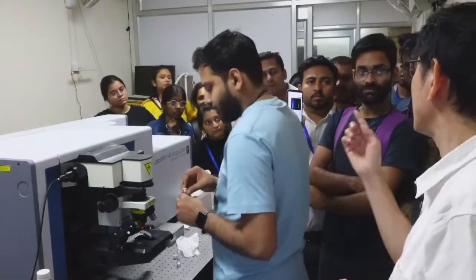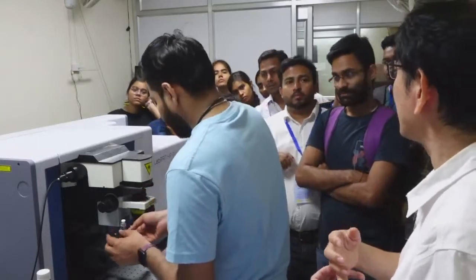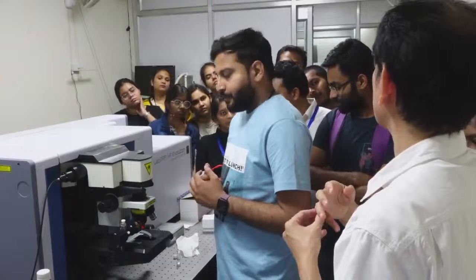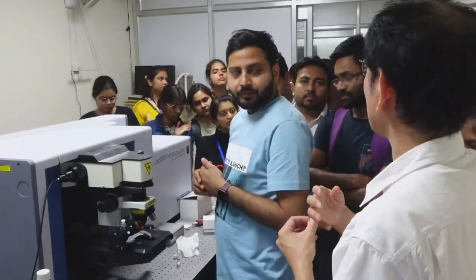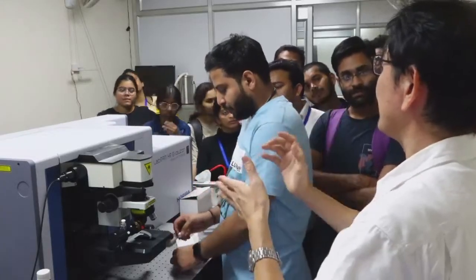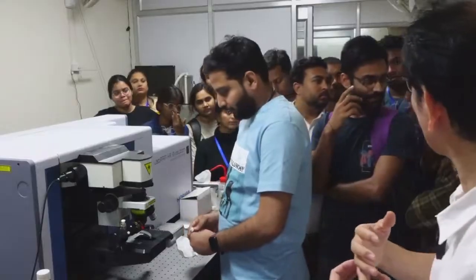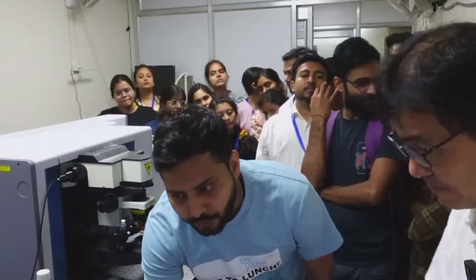This is measured by the digital camera. So you may refer to some publication. A friend, Nomoto-kun, prepared that paper. So put a grating and set the digital camera instead of a CCD detector, and it's possible to record. This is you taking photos.